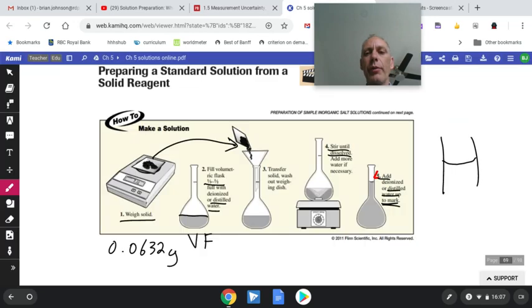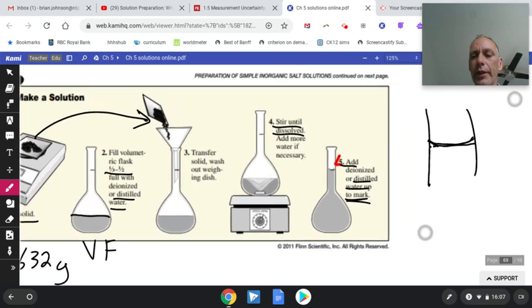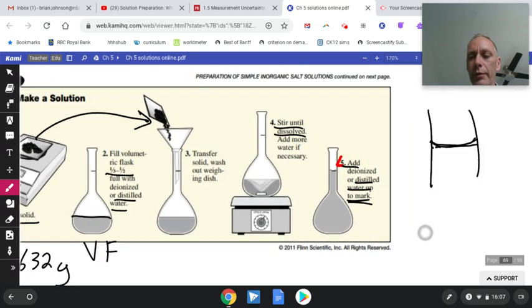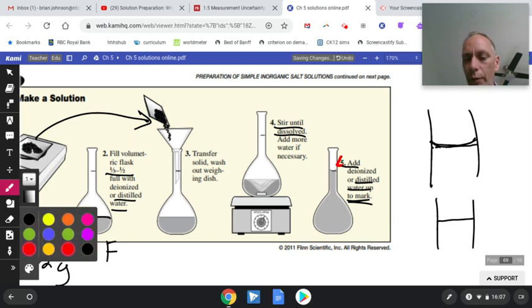21.6 or 21.7. On this one, you are bringing that meniscus down to the line. That's not a very good drawing. I'm going to draw it even better for you. Okay, let's put our line like that, and our meniscus of water will dip down.